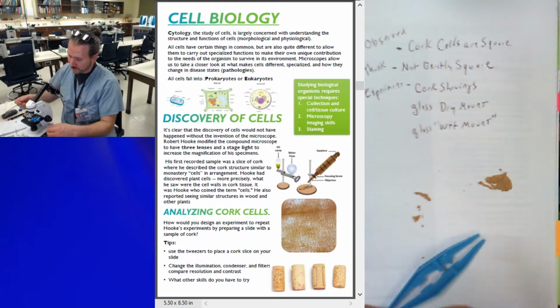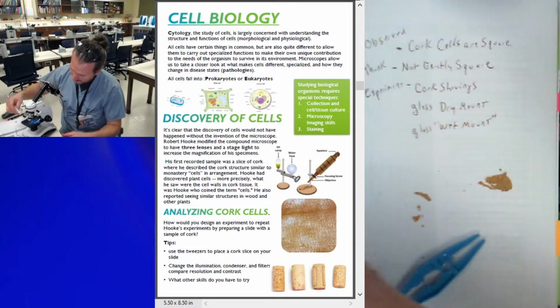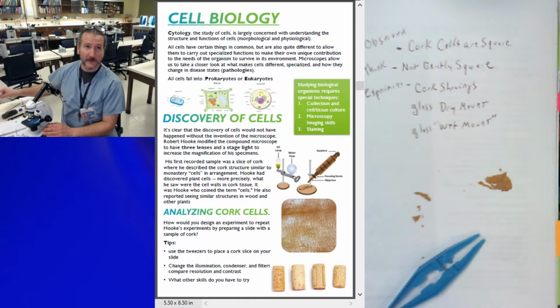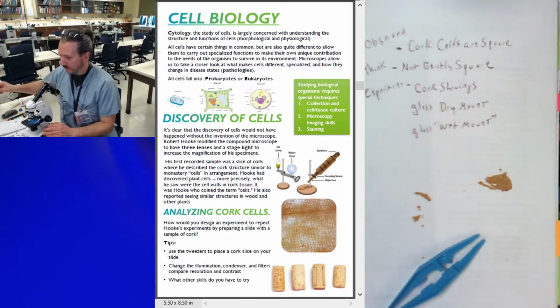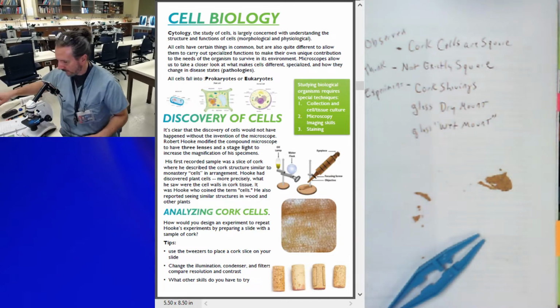Right there. I'm going to bring my stage all the way down, take my tissue paper. I'm not hitting the lens, I just had some stuff on my stage because I want to make sure I use lens paper, and this is actually a Kim wipe right here. But I have lens paper too, just haven't used it yet. Everything looks pretty good. Actually, looks like I have a little something on there.